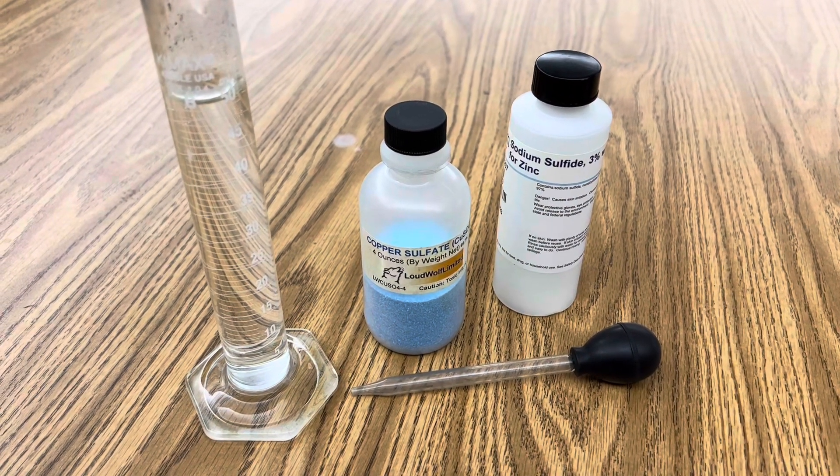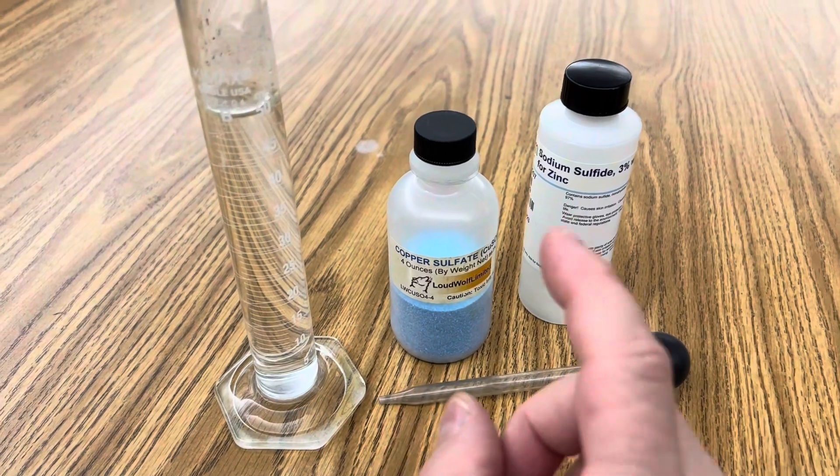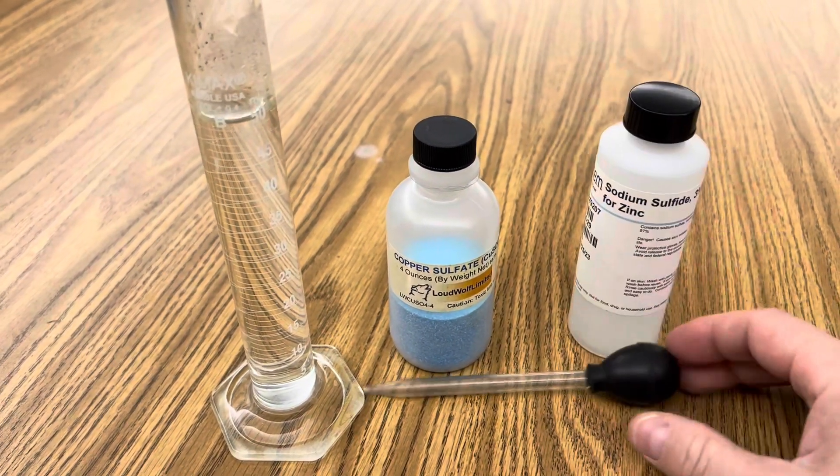All I'm using in this reaction is a graduated cylinder with distilled water, copper sulfate, and an aqueous solution of sodium sulfide and a dropper.